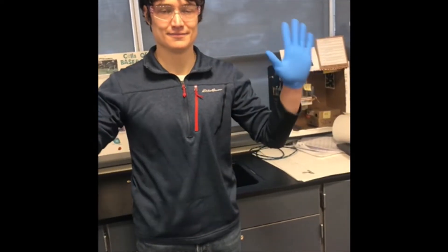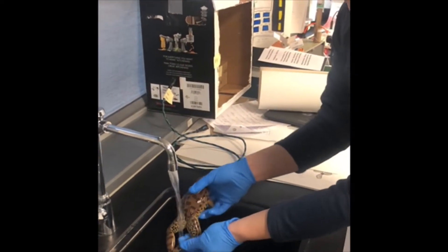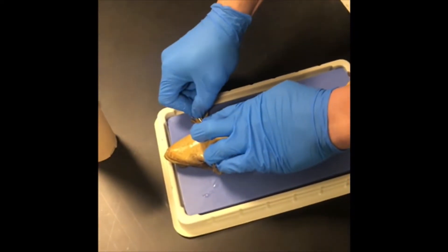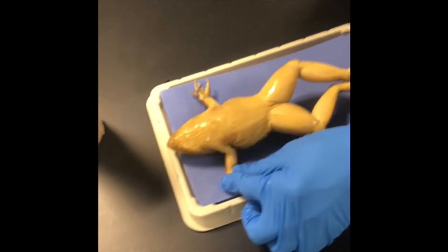Step one: put on goggles and gloves. Rinse your frog thoroughly with water in the sink. Place the preserved frog in a dissecting tray. Pin back the arms and the legs, angling the pins away from the body of the frog so they will not interfere with your dissection.